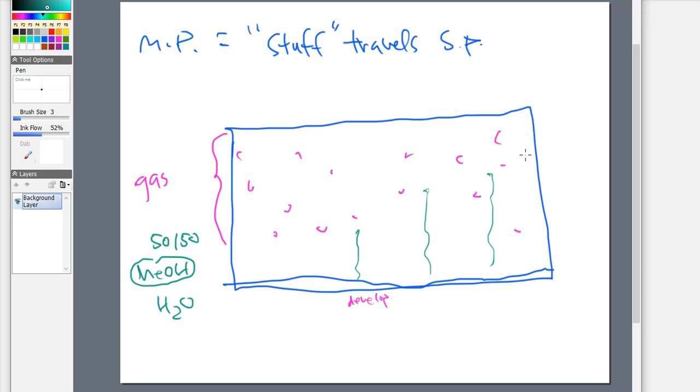And if it is, and if it's evaporating and leaving, then guess what, folks? The developing solvent that I made, that I poured in here, is not the same stuff that's going to travel up the plate once the plate goes in. And the reason is because I started with the 50-50 split of methanol and water, but methanol is evaporating off. Methanol is losing out of my developing solvent.